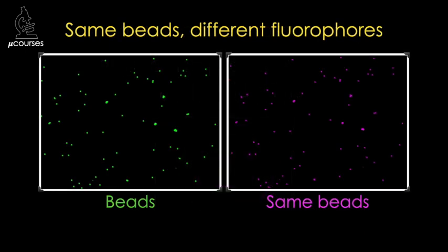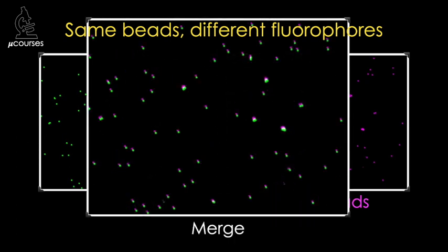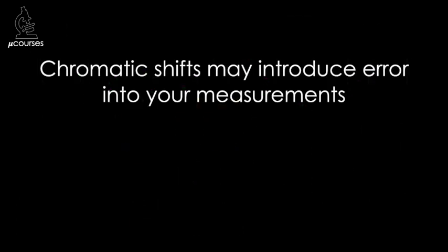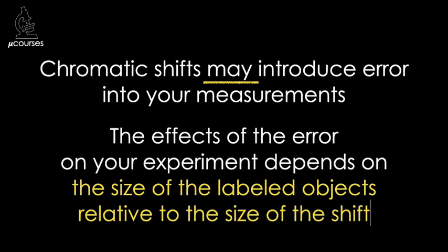These are digital images of a known sample — fluorescent beads that are each labeled with more than one fluorophore. When we merge these together, you can see that in this example there's a chromatic shift across the entire field of view. Since we know both the green and magenta fluorophores are attached to the same bead, something has got to be wrong here. Gone undetected, these chromatic shifts may introduce an unacceptable level of error into your measurements. Why do I say 'may' instead of 'will'? That's because the effects of the error on your experiment depends on the size of the labeled object relative to the size of the shift, and the size of chromatic shifts can vary quite a bit.